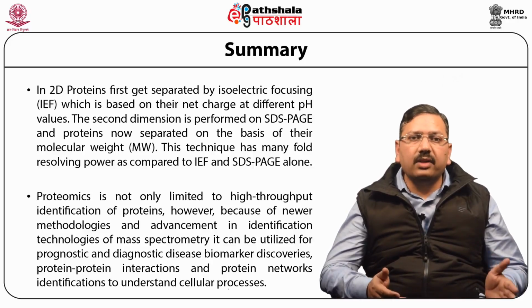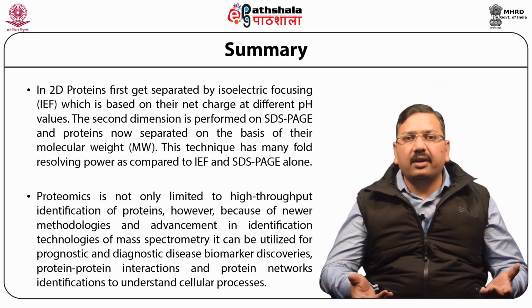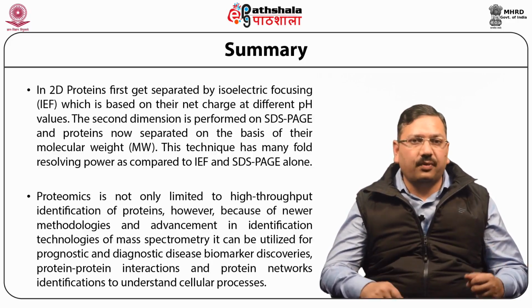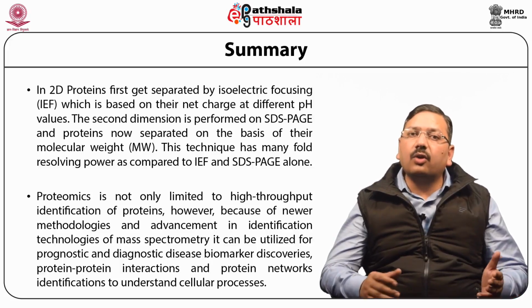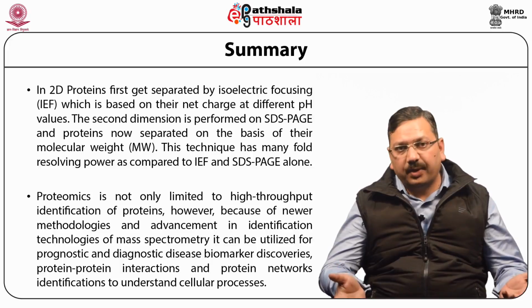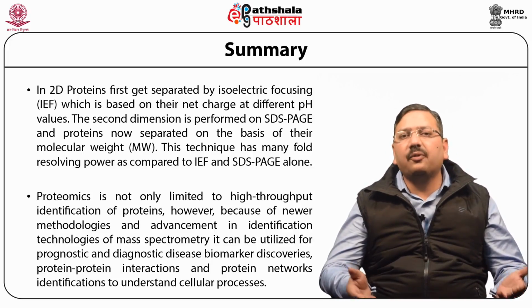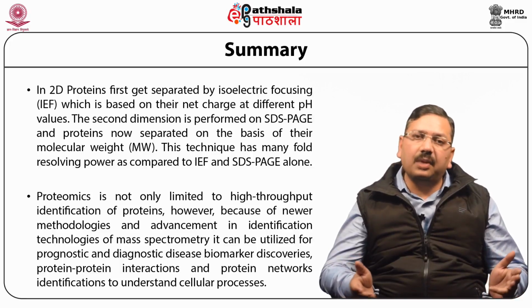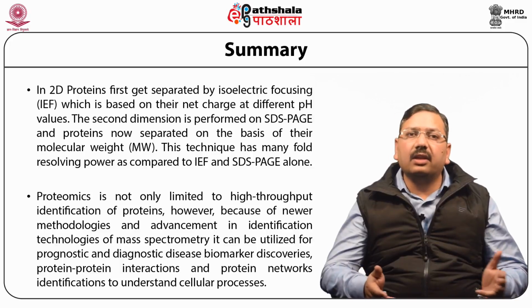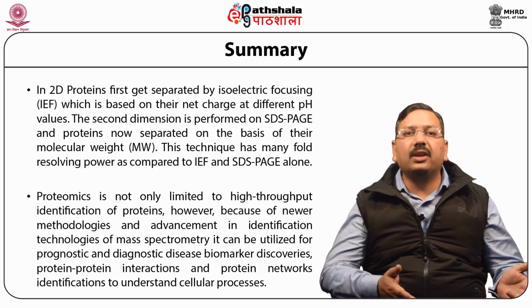Moreover, proteins which are not in the database are very difficult to identify or sometimes cannot be identified. Moreover, multiple runs require more money and are more expensive. And lastly, proteins are fragile molecules and they can be degraded easily. And most of the time, you will find the reproducibility problem comes because of gel-based proteomics.